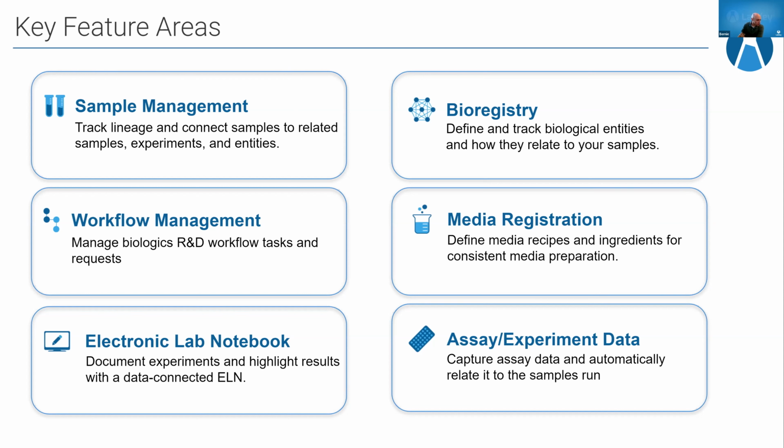Okay, with that, I do see a number of questions. Let me give them a quick read here before I move on and see if now is a good time to answer some of them. Okay, so there's some interest in what an implementation looks like.